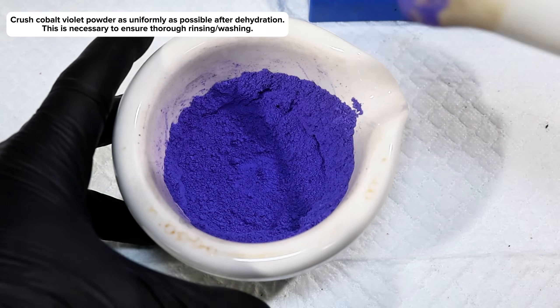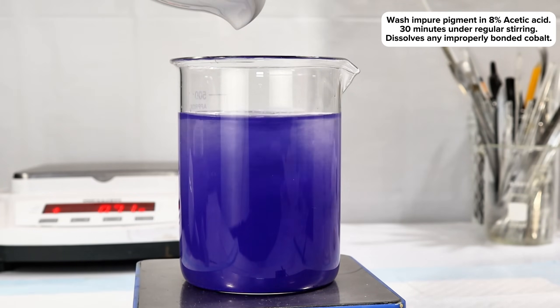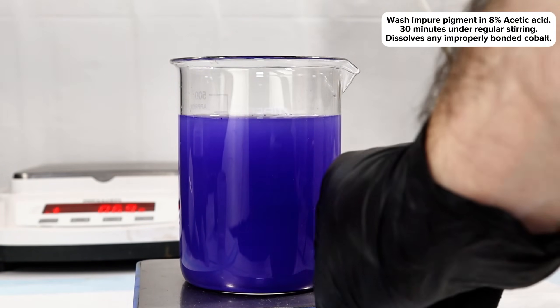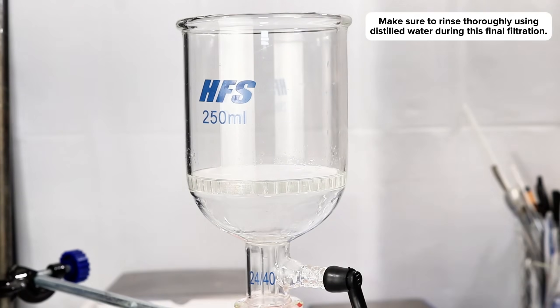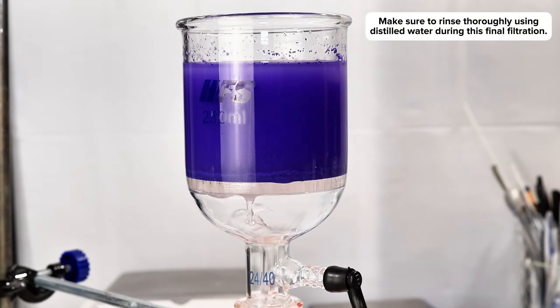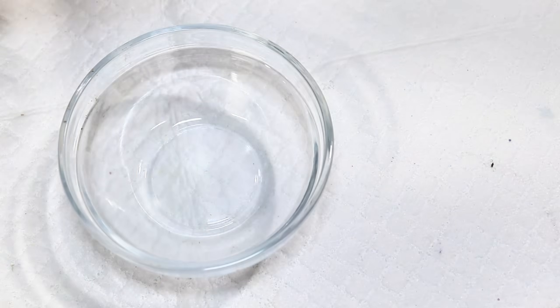The powder was next transferred to a beaker of 8% acetic acid and mixed thoroughly for about a half hour. This is done to remove any cobalt that hadn't fully fixed to the phosphate, and it helps to stabilize the final pigment. This was then collected one final time in my Buchner funnel, rinsed thoroughly with distilled water, and transferred to a new dish to dry.